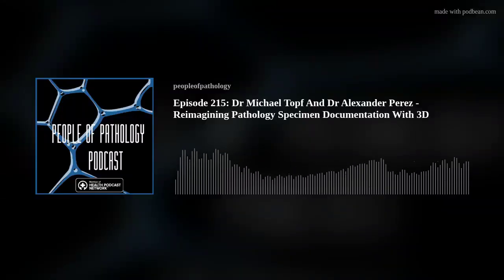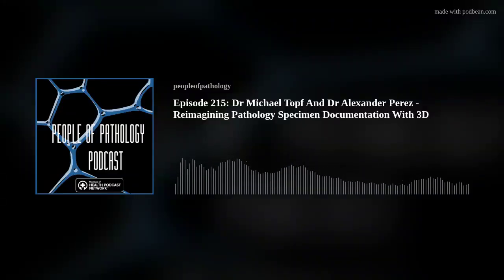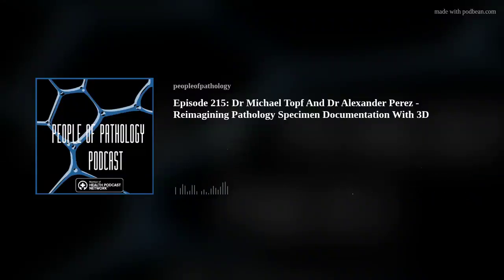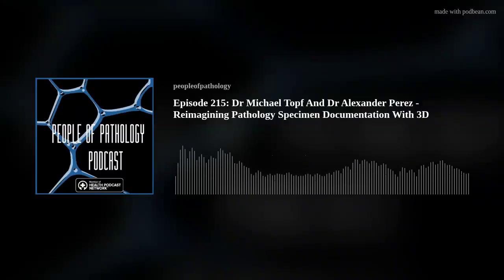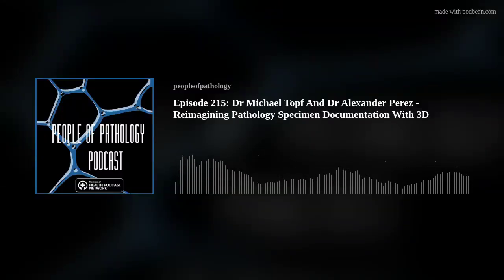So if you have the tool, understanding how to scan the specimen properly, how to get the proper environment to get good results and not get discouraged when the models aren't perfect up front, and how to troubleshoot getting the two halves of the model together. All of those things factor into getting the adoption, because as Mike alluded to, once we got things going and once you showed what it can do, everyone is all on board. So really what you need to do is just get that initial step of showing them the first couple really nice looking, crisp models that you've made, and then showing how beneficial it is. And then people tend to be quite receptive to this technology.